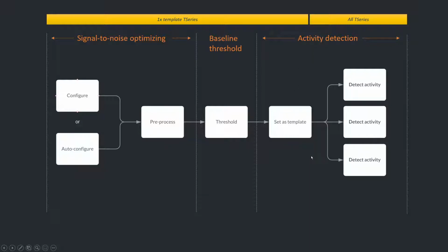This is a process that can take a little bit of time depending on the size of your data, such as your frame rate. But usually on a fast computer, it's done in not that long. We're talking minutes rather than days. Of course, if you have a lot of data, the batch process can run for quite some time still.